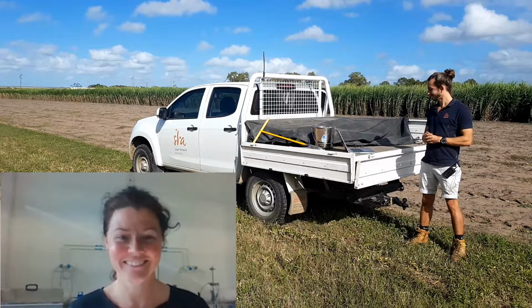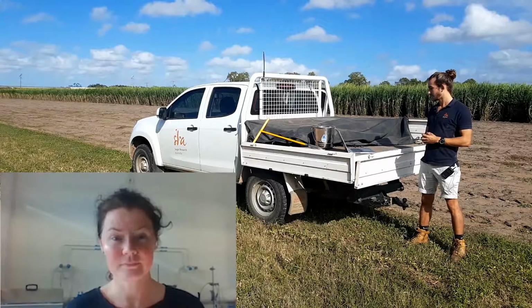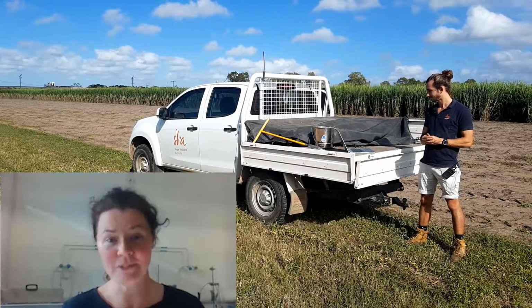Okay. So when it comes to soil microbiology, Nicole, there's quite a lot going on down under the soil, isn't there? There's a lot of different things you can measure. Here at UQ, we're focused on the microbiology, looking at the different biomass and enzyme activities, different microbes.